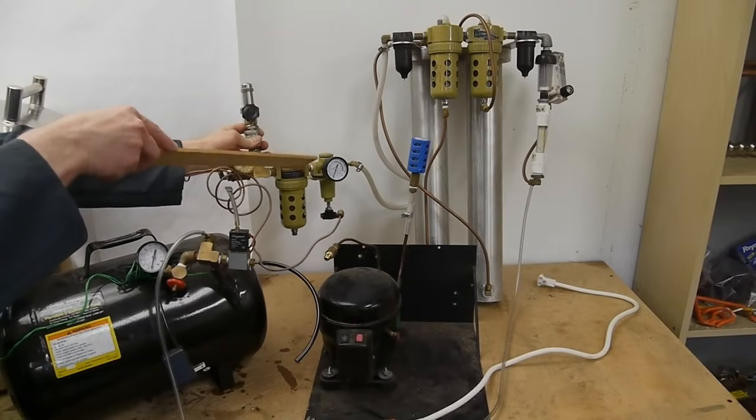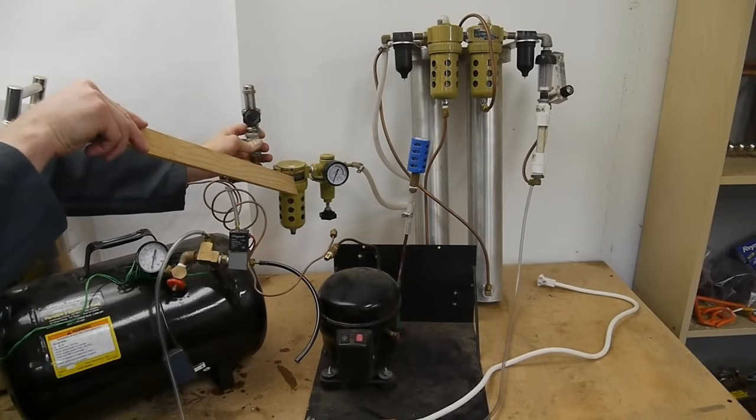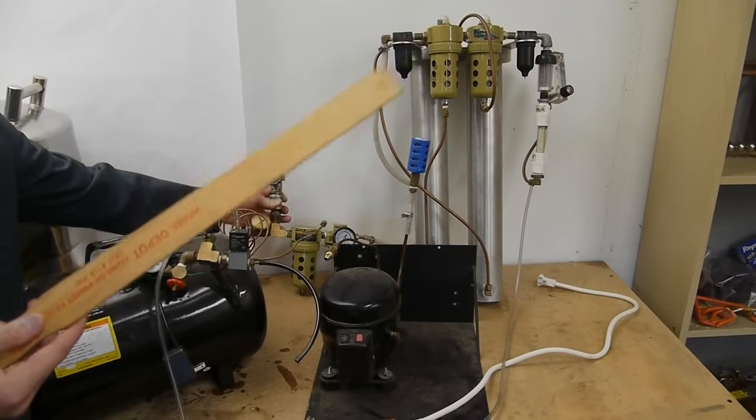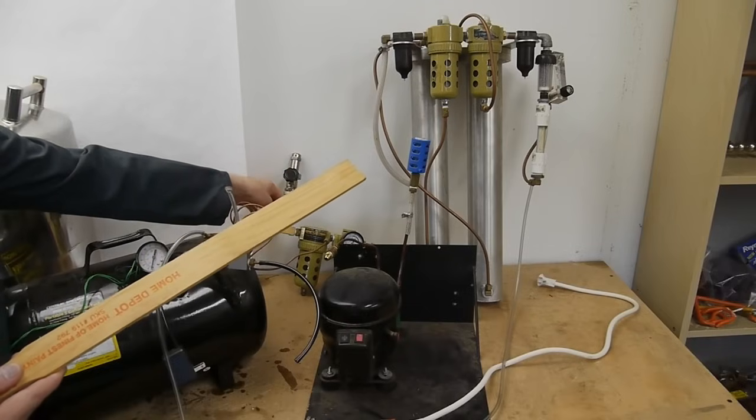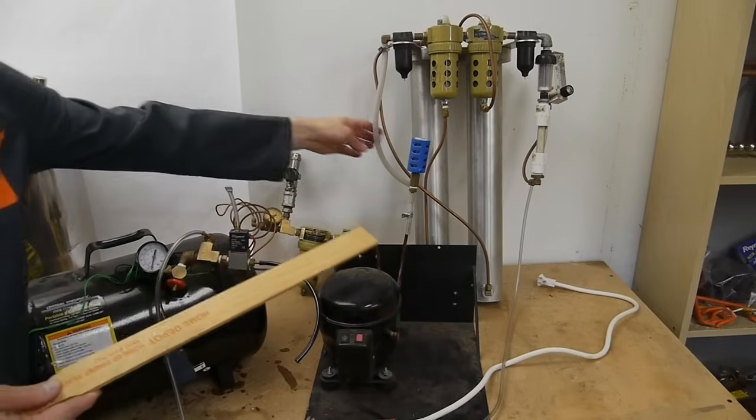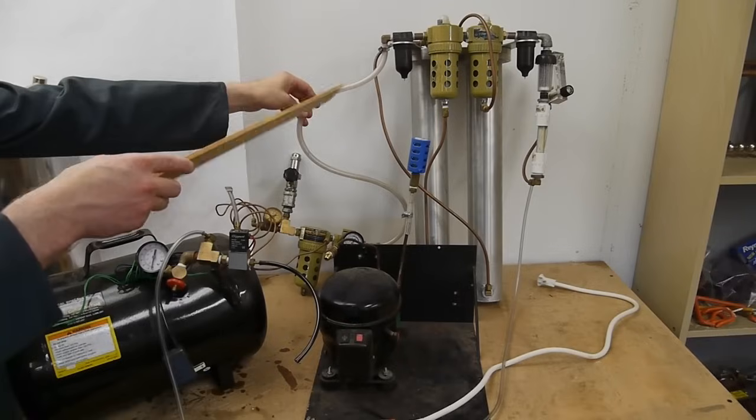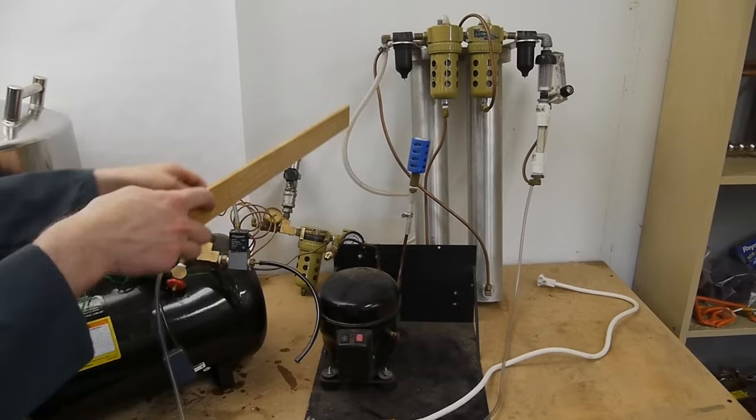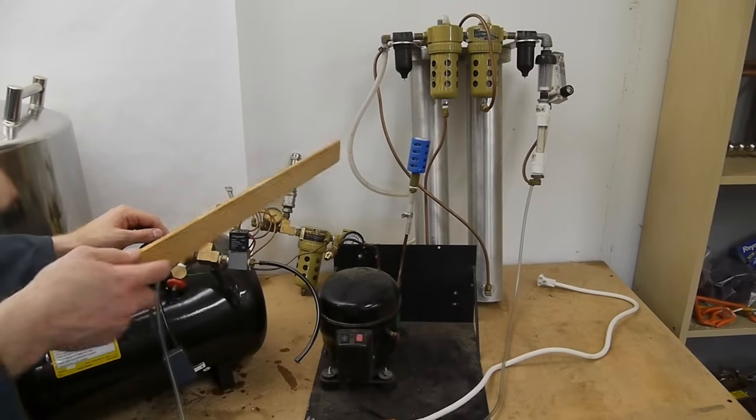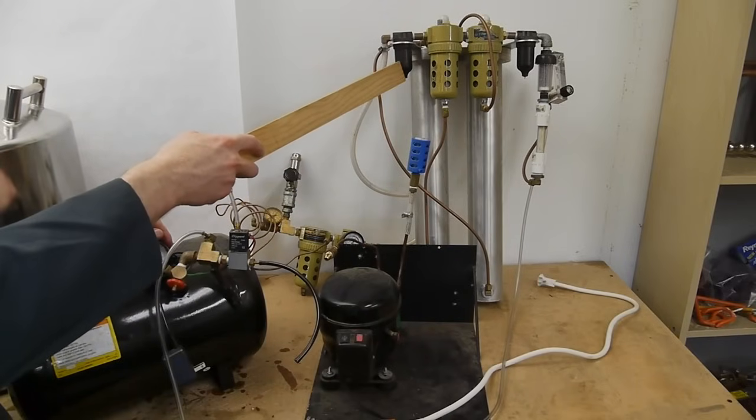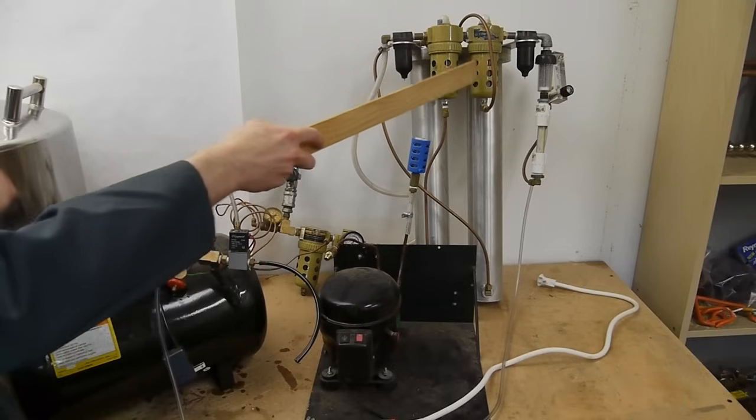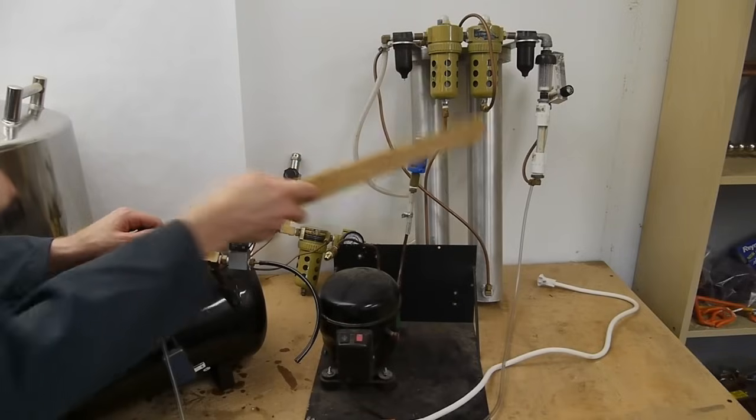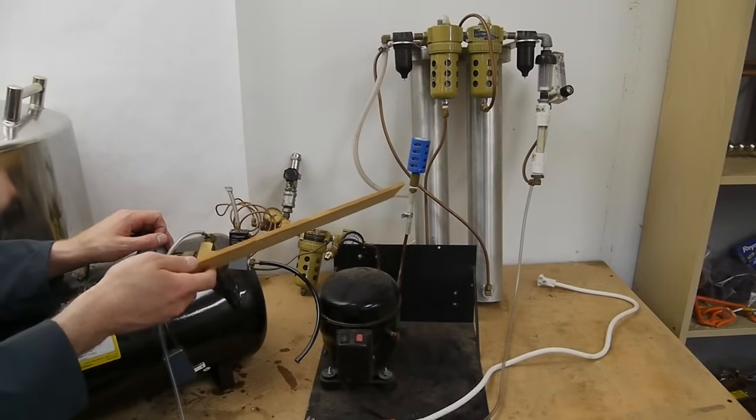The first stage is just to get out a lot of water and oil mist here and then there's a regulator to step it down to 80 psi or something just to get a constant pressure from there. And then the semi-dry and semi-wet 80 psi air goes into this whole setup and even though it looks complicated it's really just a bunch of filters over and over again. So there's an oil coalescing filter and then these I've actually packed with carbon to try to get more of the oil mist out and the cylinders in the back are filled with silica gel to dry the air.